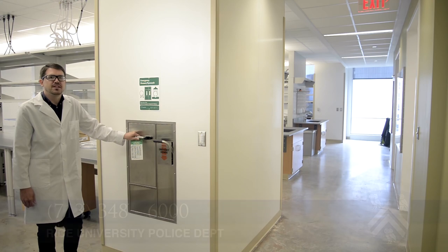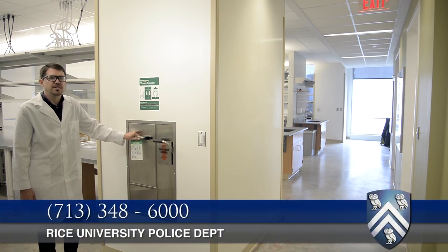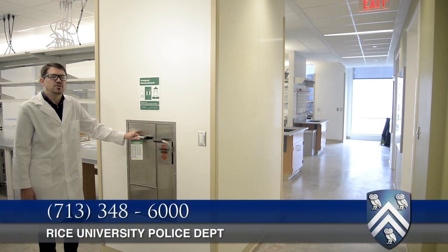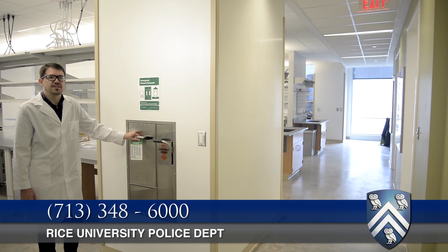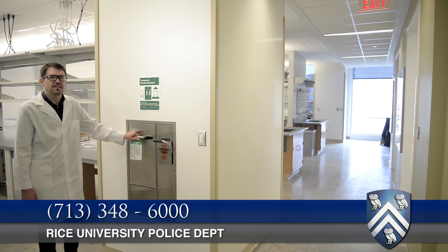After any injury or emergency, contact RUPD at 713-348-6000 or extension 6000 from any campus telephone. Make sure to know your building and room number so you can communicate that clearly, and fill out an accident and injury report form.